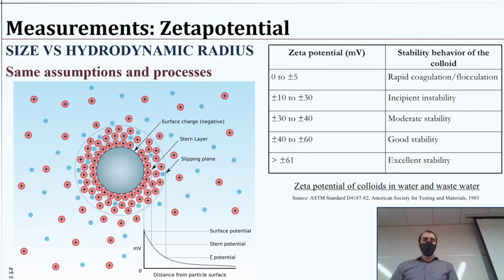And so just as a reference, thinking back about the ones I mentioned, I had one that was varying between plus and minus 10 in that range with observations. That one was obviously not very stable. I had one that was about plus 20 or so, and that was stable enough. And then I had one that was about plus 30, it was definitely stable. And then the negative ones were all somewhere between negative 40 and negative 60 when I measured them. And so those were certainly stable, even in the long term.